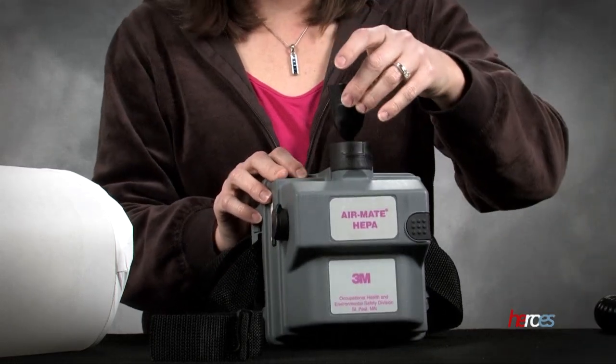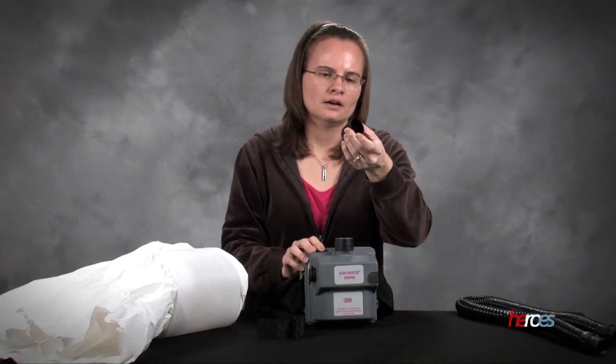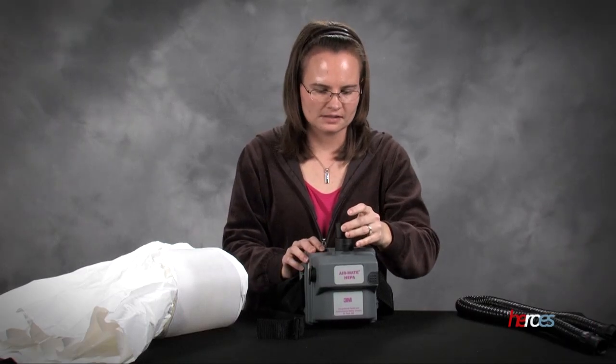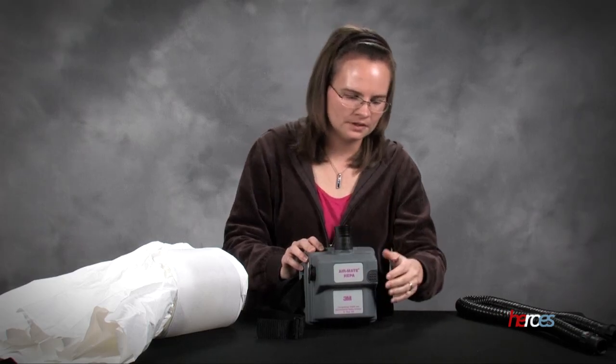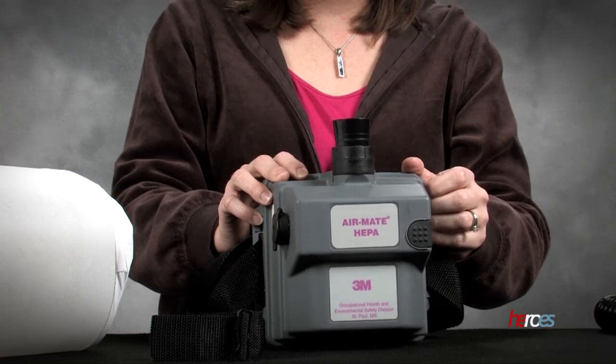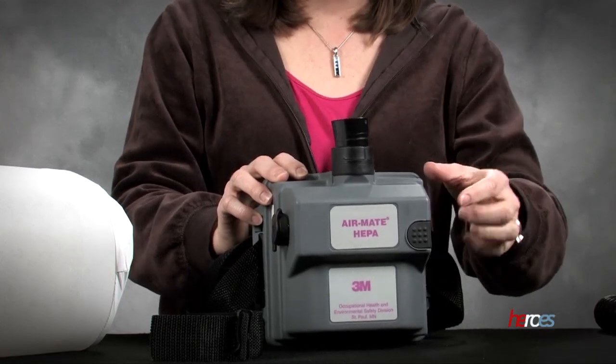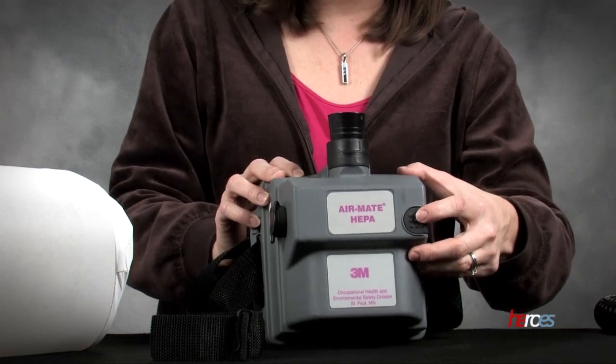We're going to go ahead and place the tester device. It's actually a little bullet-shaped plastic piece that's weighted in the bottom, so when the power goes on, it should start to just float in the top. And that lets us know that we have enough power coming from the fan.